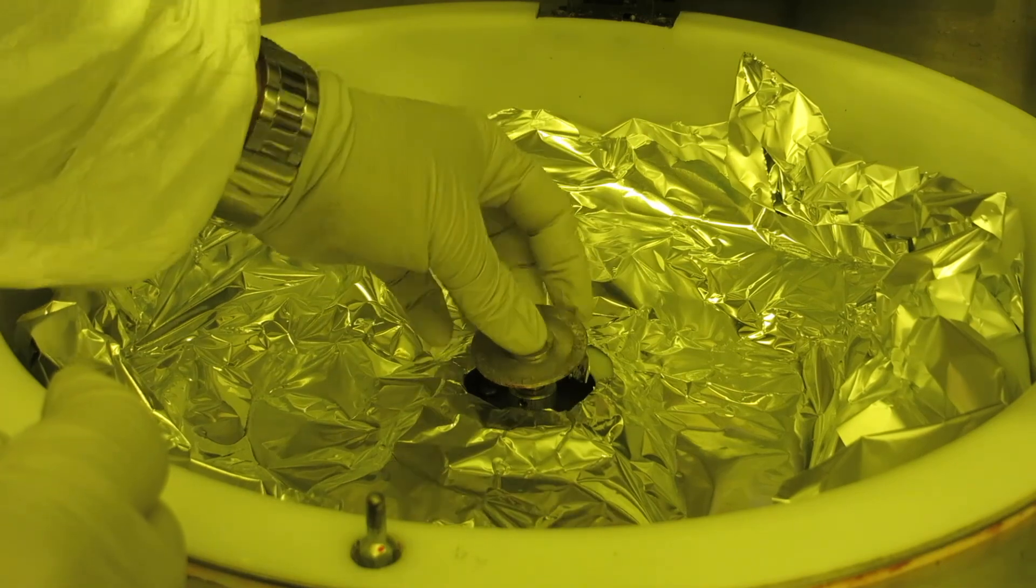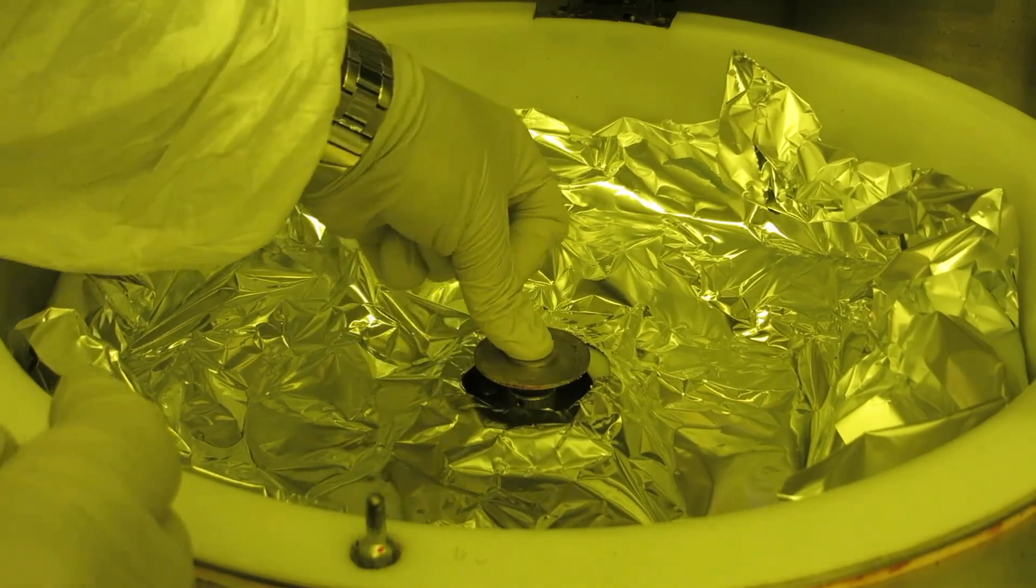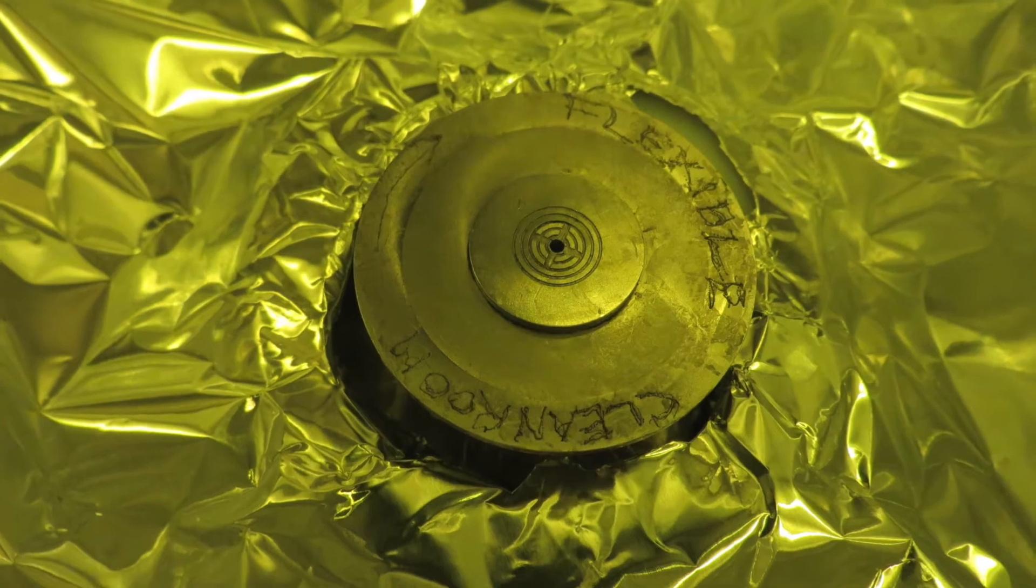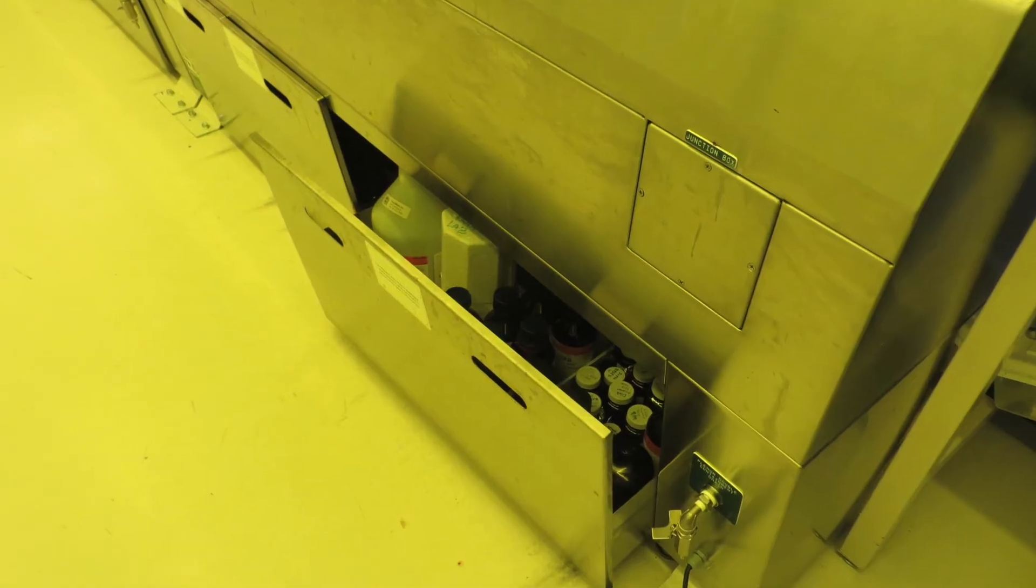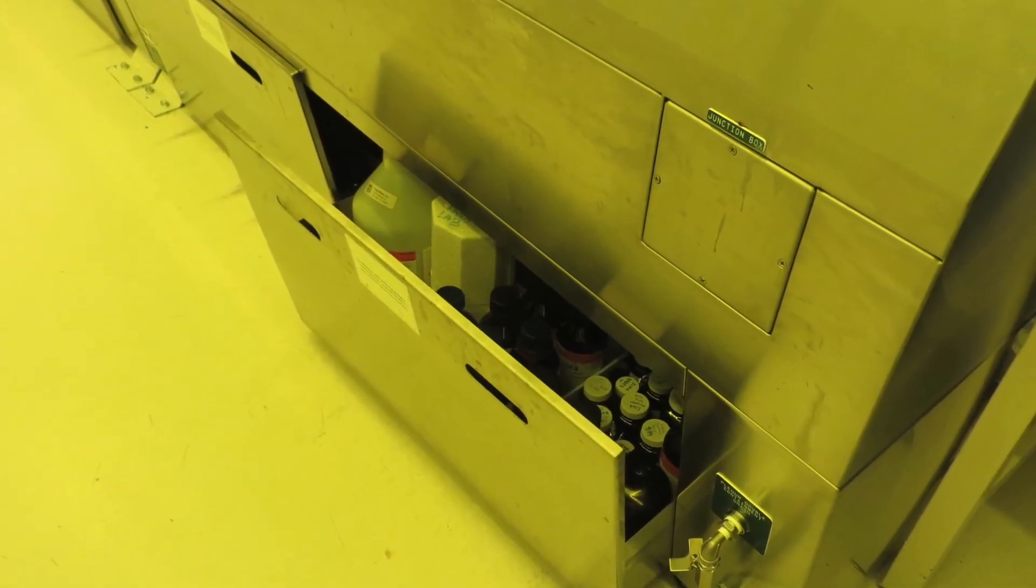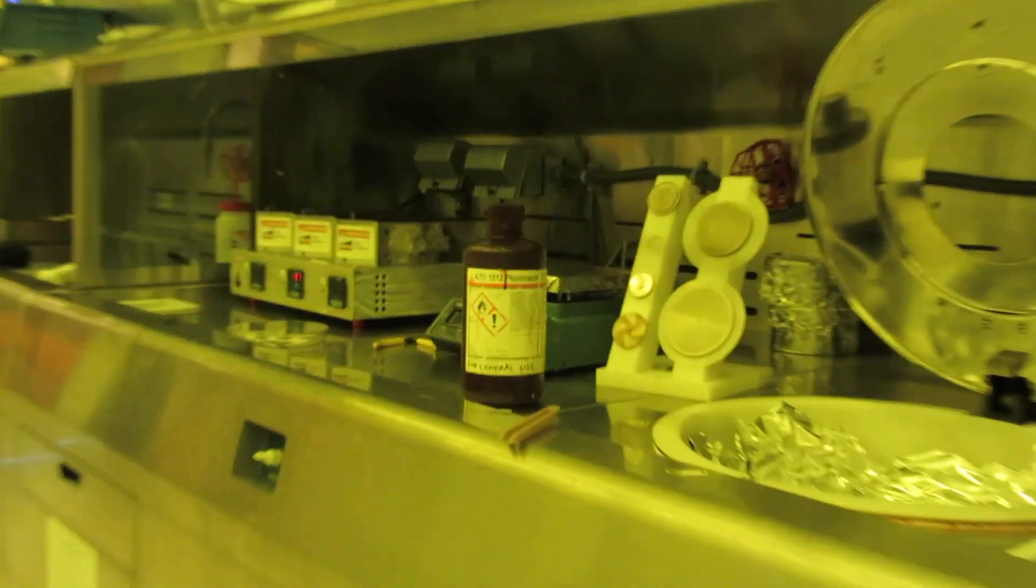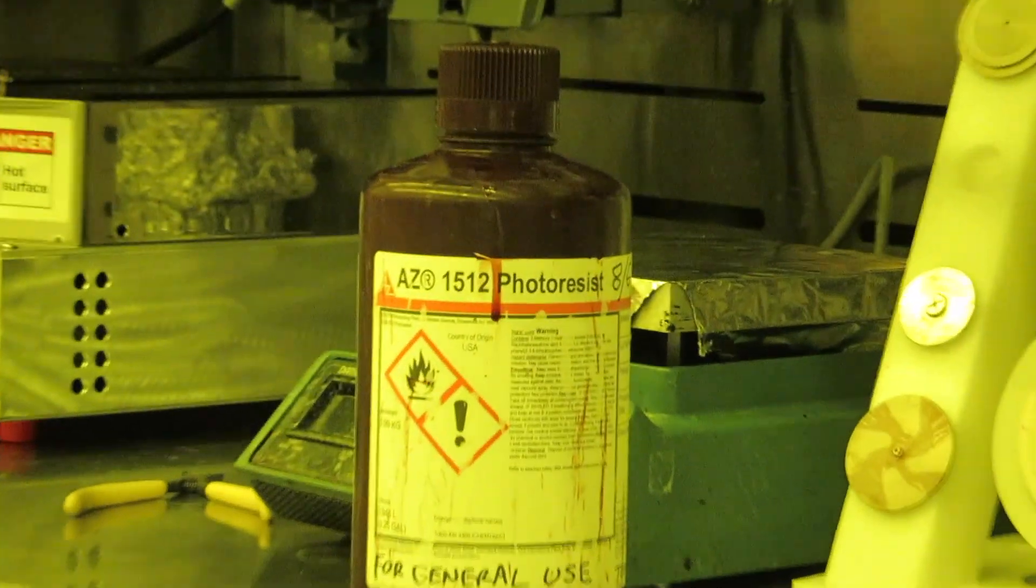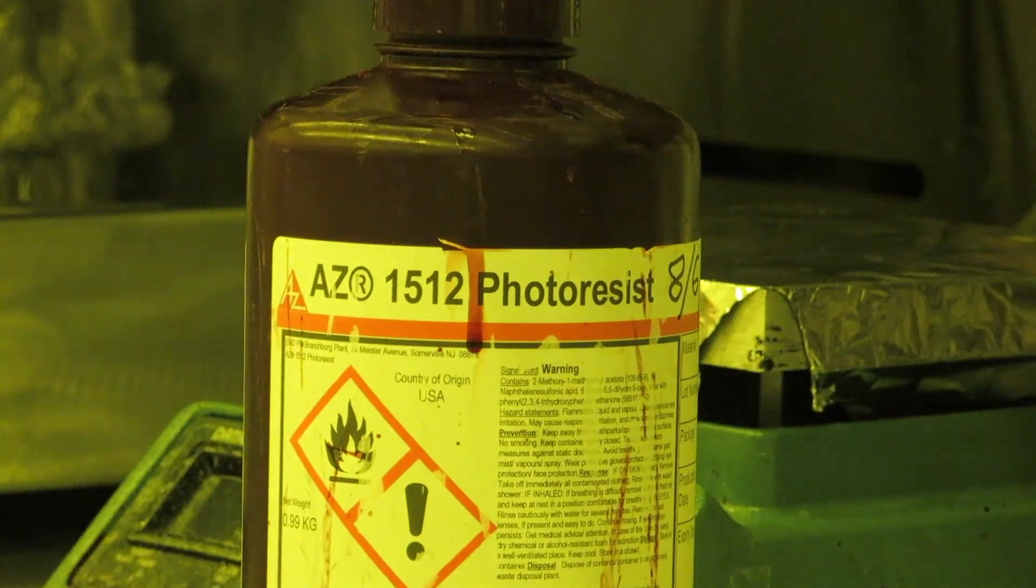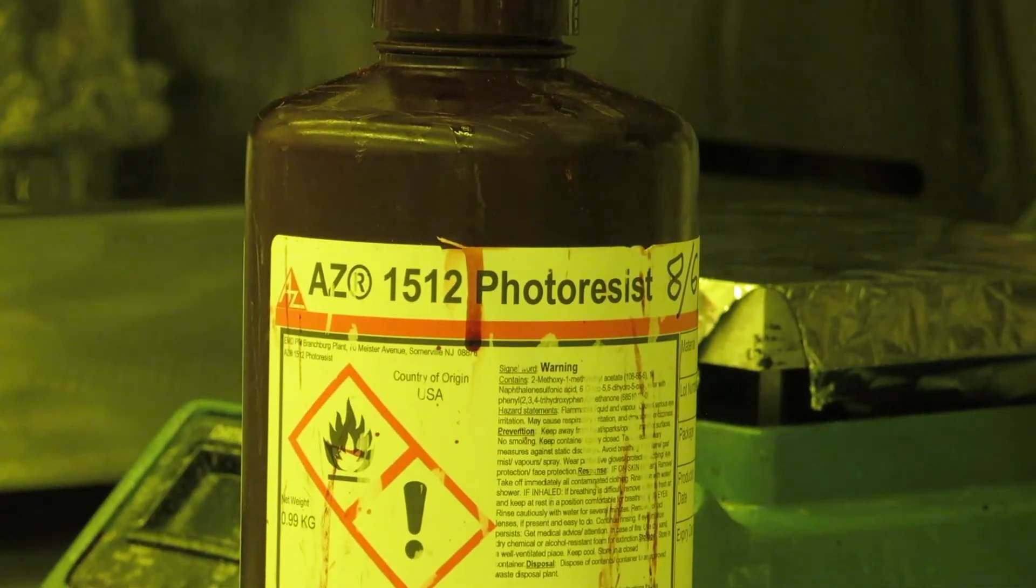The O-ring makes a seal between the chuck and the shaft. In the drawer below is where you will find most of the photoresists. We provide this AZ1512 resist, which is a good general purpose positive resist. In a positive resist, those portions which are exposed to UV light are what washes away during the subsequent development step.